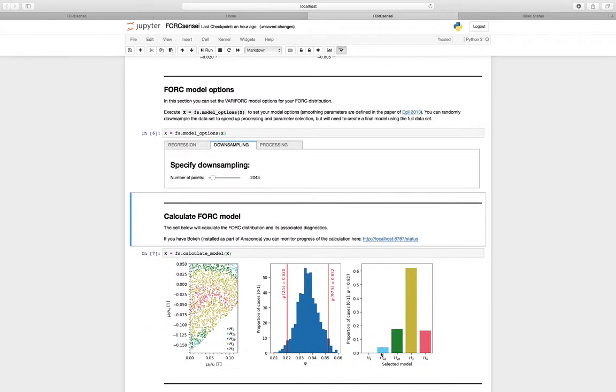And the histogram on the right corresponds to the points here. How many points do we have that correspond to a cubic polynomial surface? How many points do we have that correspond to a fourth order polynomial surface, and so on? These are indicators that we can use to change our regression model to optimize the smoothing parameters. Again, I can't go through a detailed discussion of that here, but I suggest that you look at our paper to see how that works. We can see in this case we're probably oversmoothed in areas like this where we have pink points, and maybe undersmoothed in some areas as well around the edges.